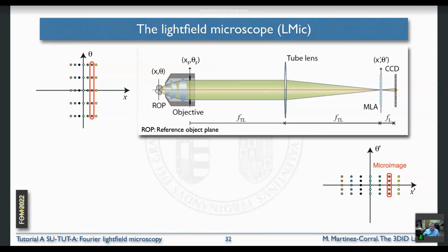But equivalently, as what we explained before in the plenoptic camera, we could calculate very easily what the plenoptic map is here.